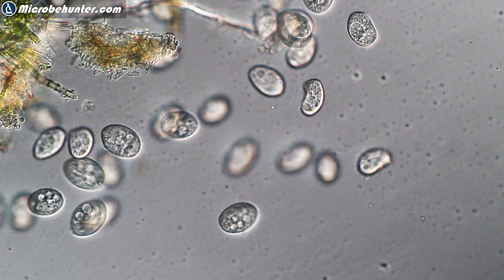First of all, if you have protozoa that move around, then generally it is often like this: some of them will move in and out of focus. They swim up or they swim down and they're blurry. When you have a video this does not disturb so much, but it becomes very evident when you look at a static image.